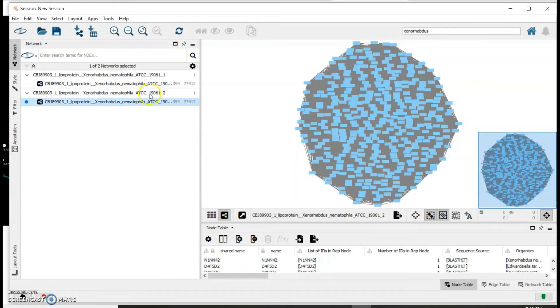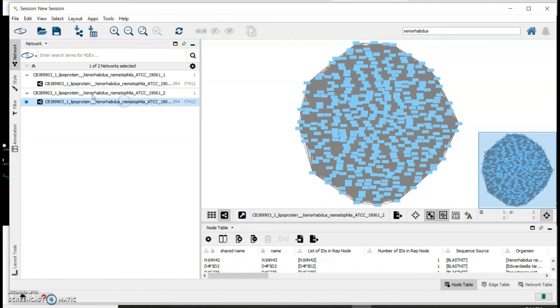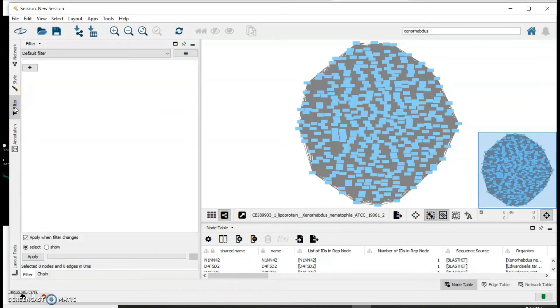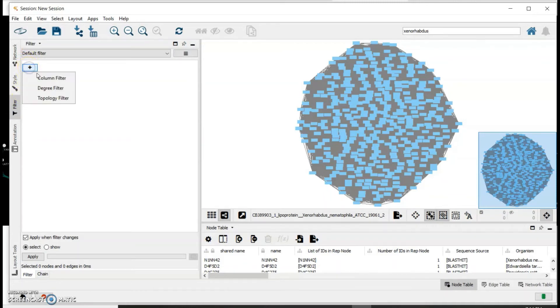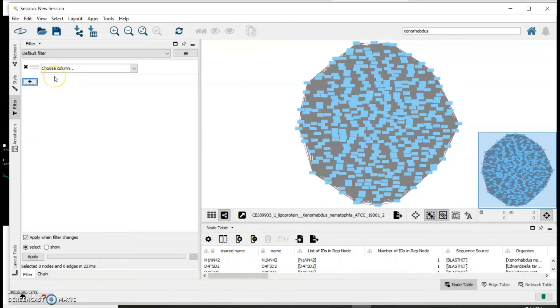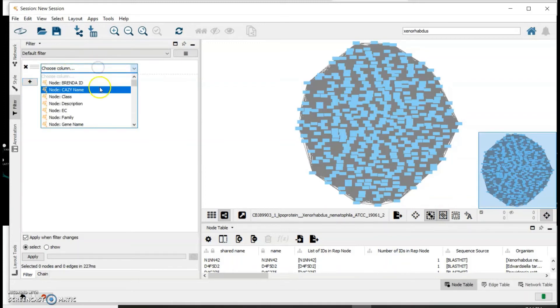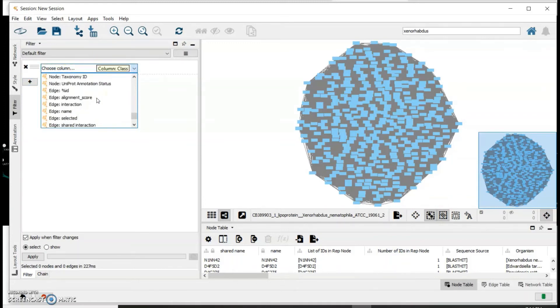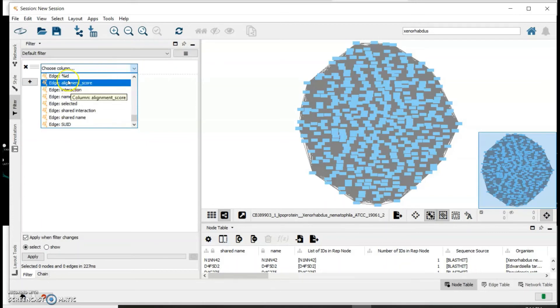From this new network we can start to destroy edges. To do that, click on the network and then click on this Filter tab, and add a column filter. Since I want to create networks based on different percent identity, I will select Edge, edge percent ID.